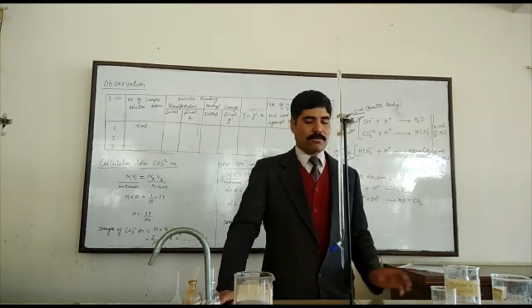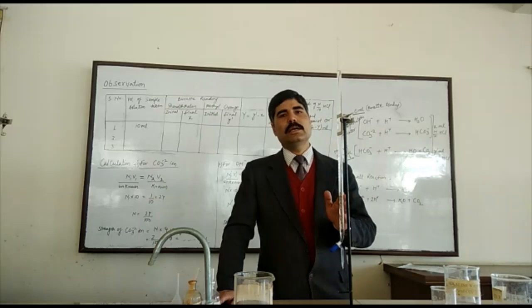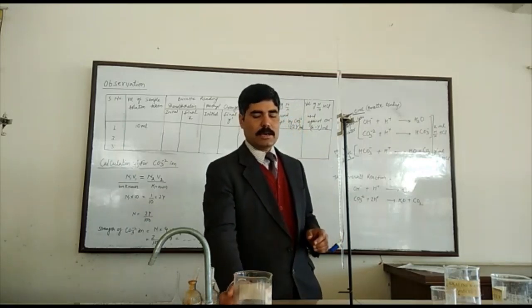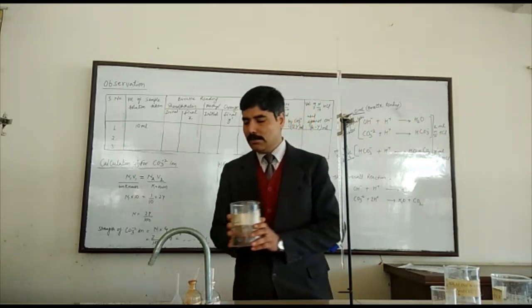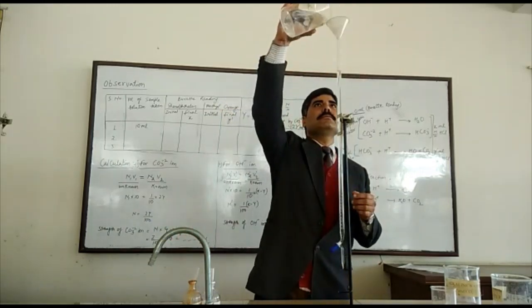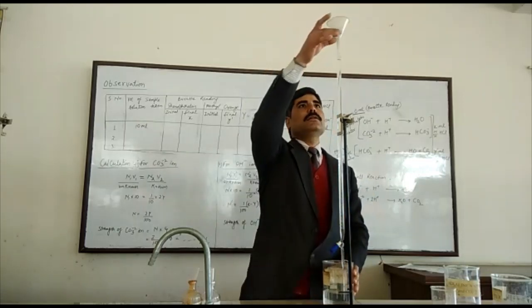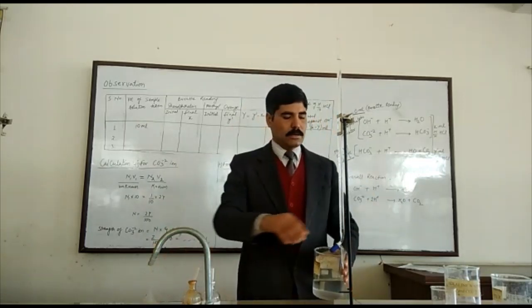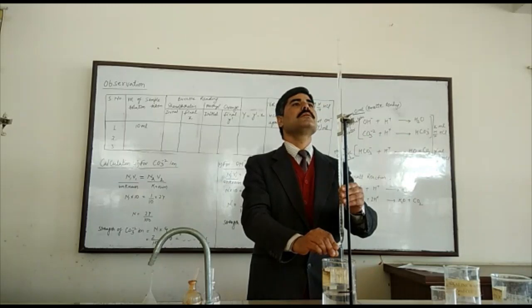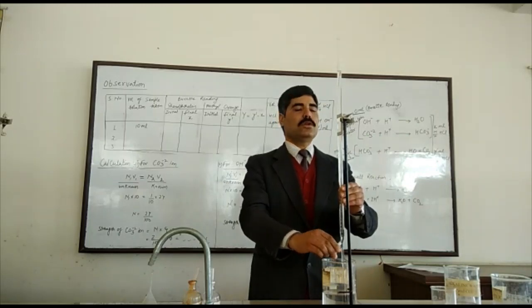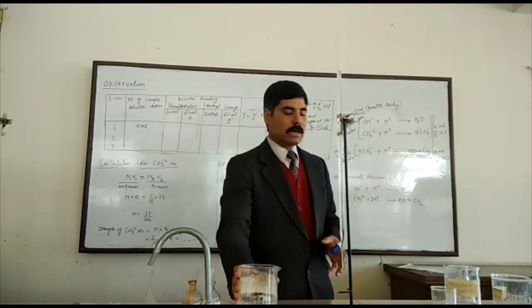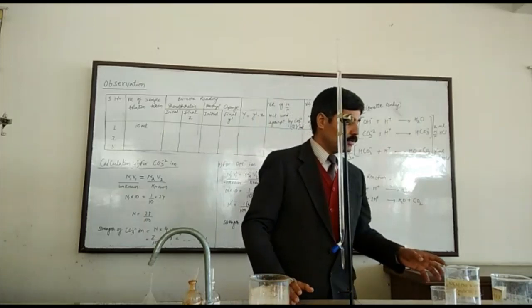Now we are going to perform the experiment. First of all we have to fill the burette. This is the 50 ml burette which we fill with the standard solution, that is N/10 HCl. We fill the burette with the help of a funnel. Remove the funnel when the lower meniscus of the liquid is set at zero, and the burette is completely filled with the standard solution at mark zero.